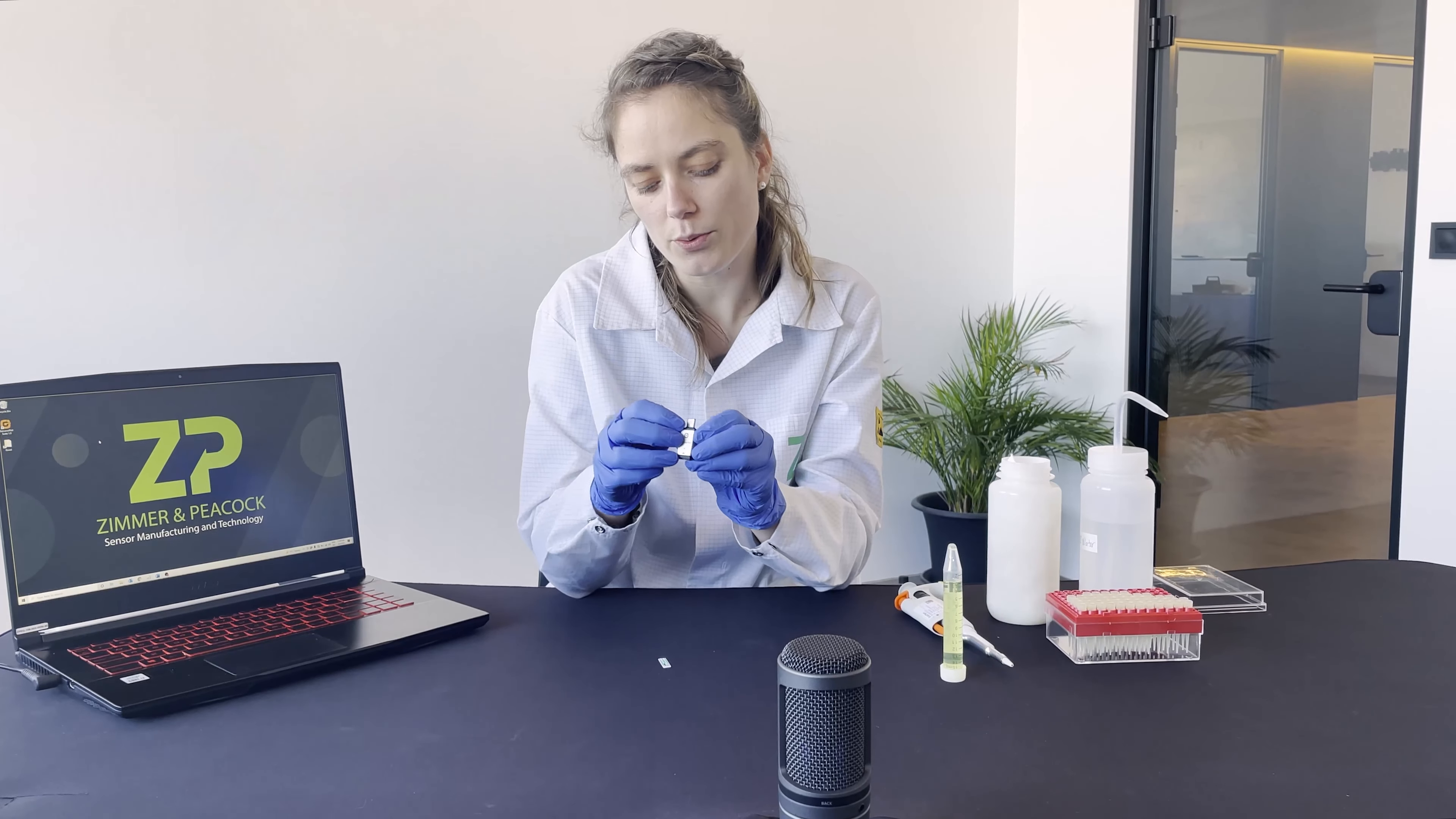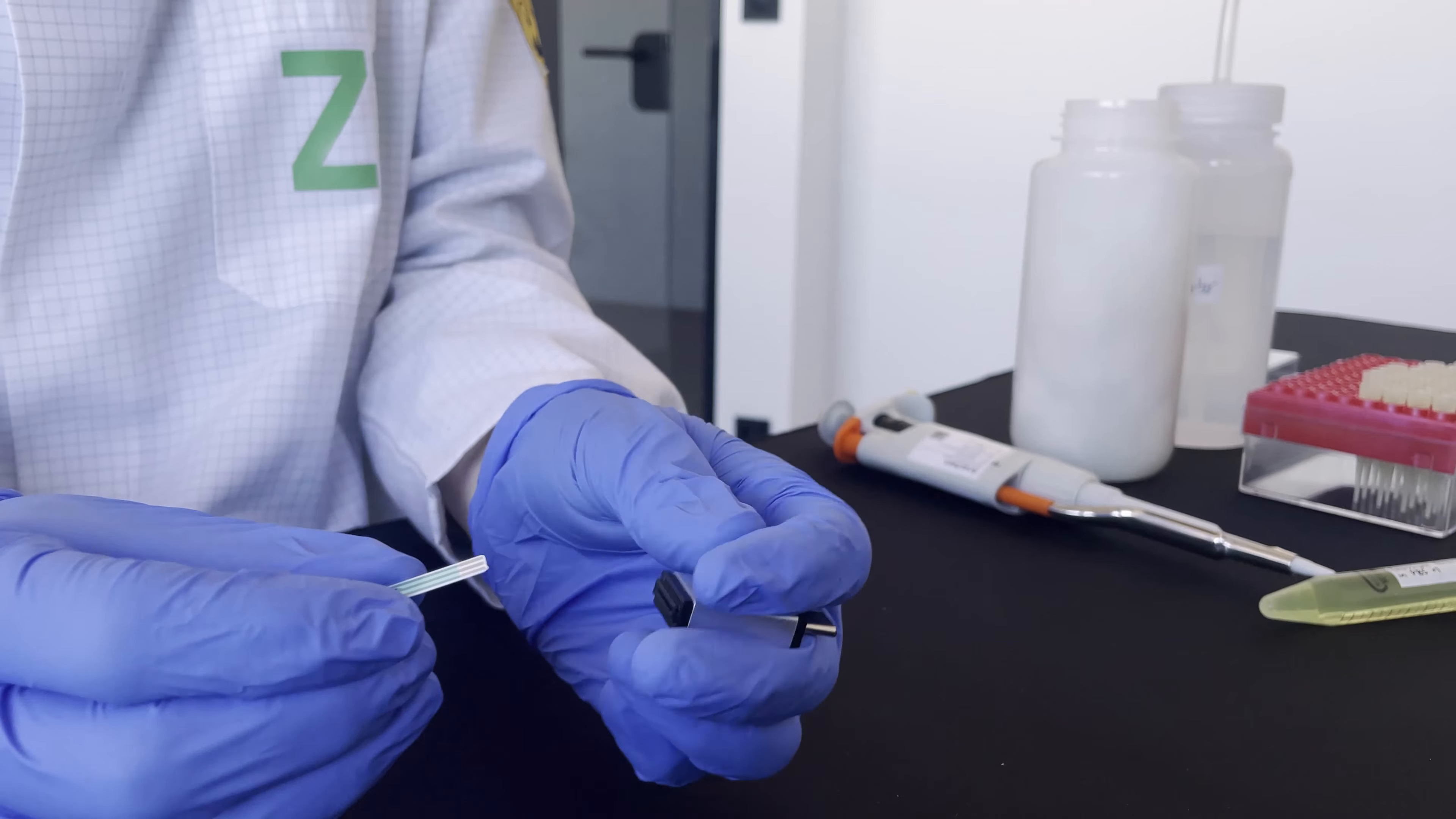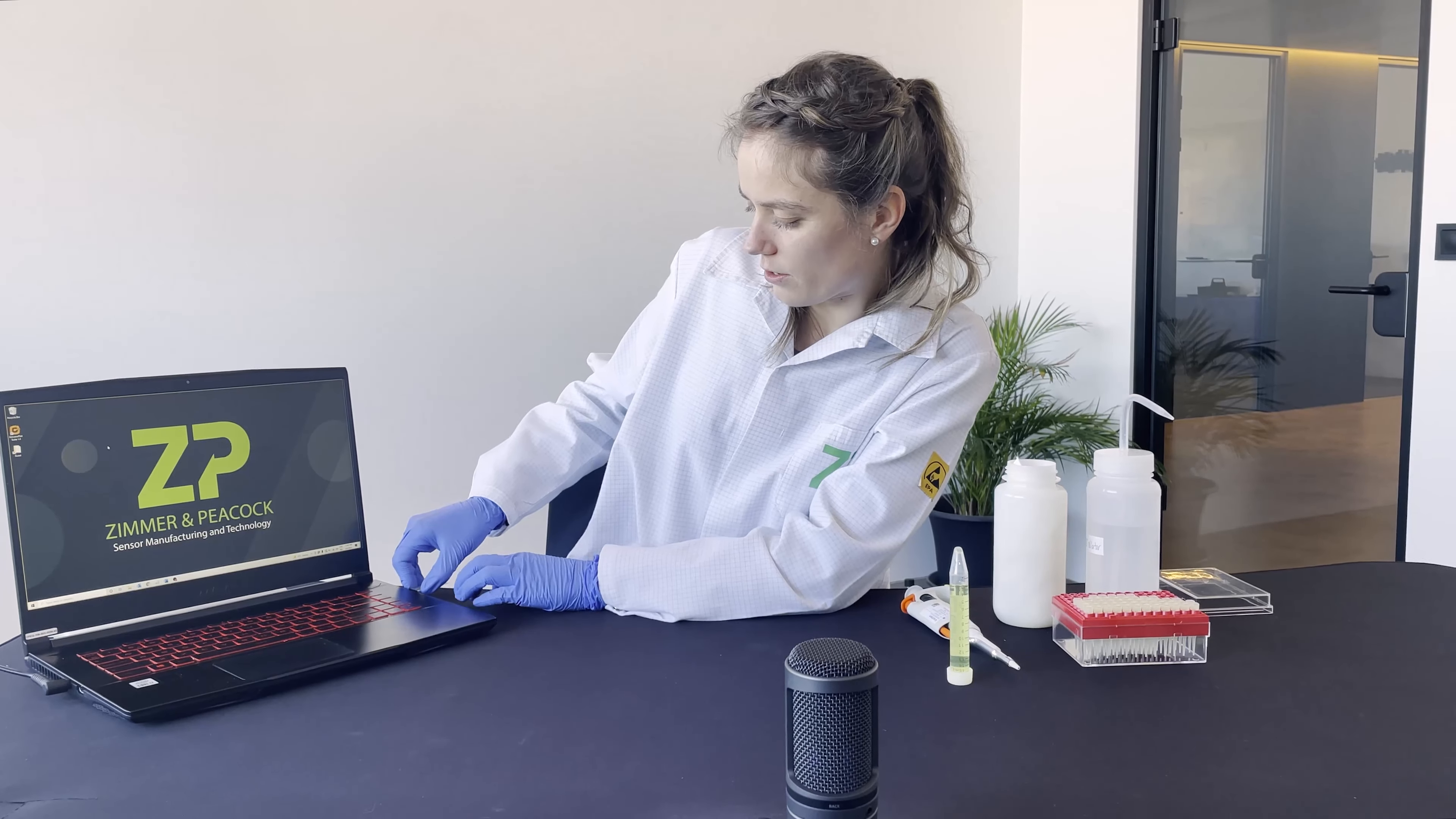We will insert a sensor into the potentiostat. Today we're using one of Zimmer Peacock's HyperValue sensors, but the potentiostat runs with several different sensors. We'll insert the sensor and then connect it to the computer.